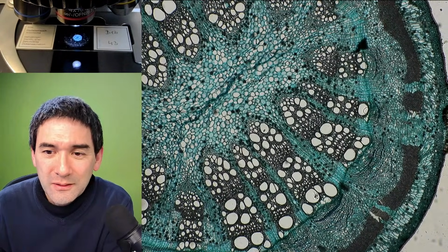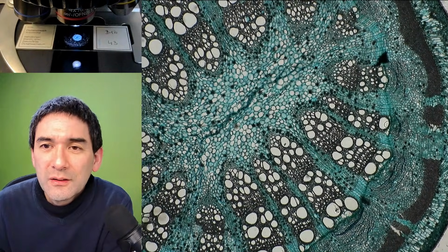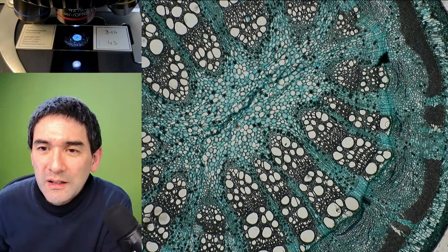As we look at this, I'm occasionally reading a little bit of what's going on in the chat.